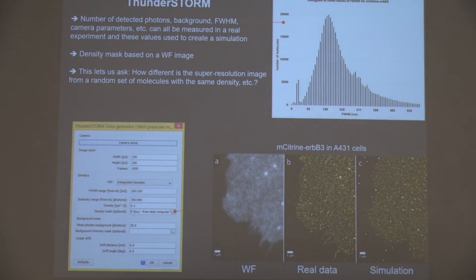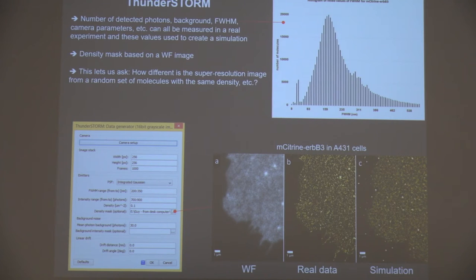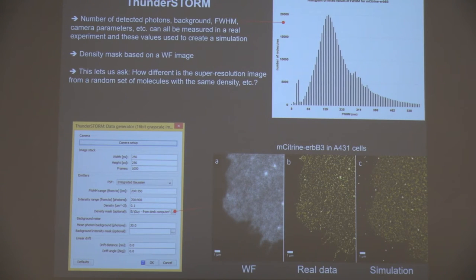A really interesting idea is creating realistic simulations based on measured parameters. Everything in these experiments can be measured: the number of detected photons, the background, the full width at half max for the molecules, the camera parameters — all of that can be measured and used to initialize the simulation. In this case the density mask we used was a wide field image. We then have the real PALM data and the simulated data, which allows us to ask how close the real data is to the simulated data. I think this is a really interesting application.